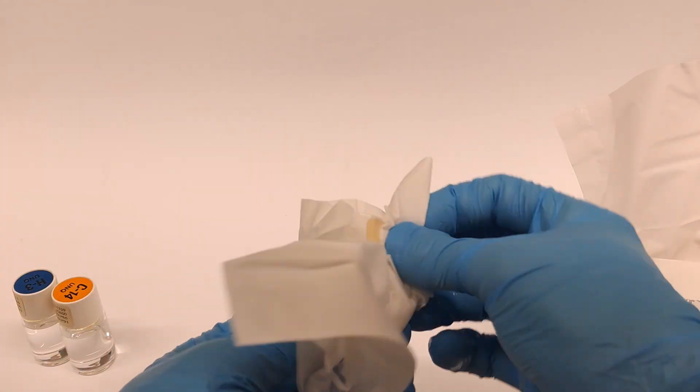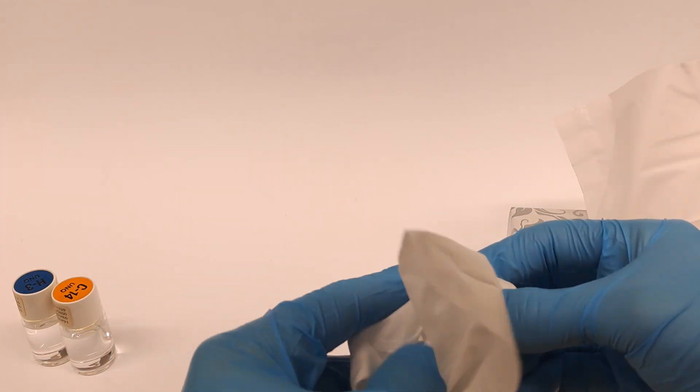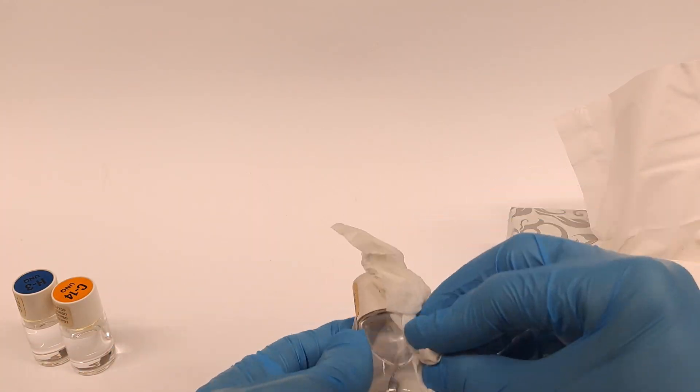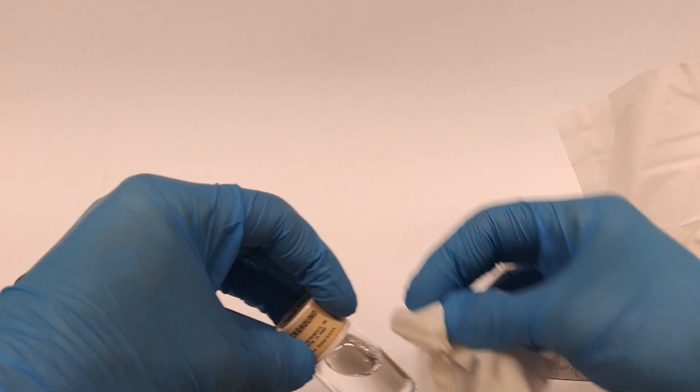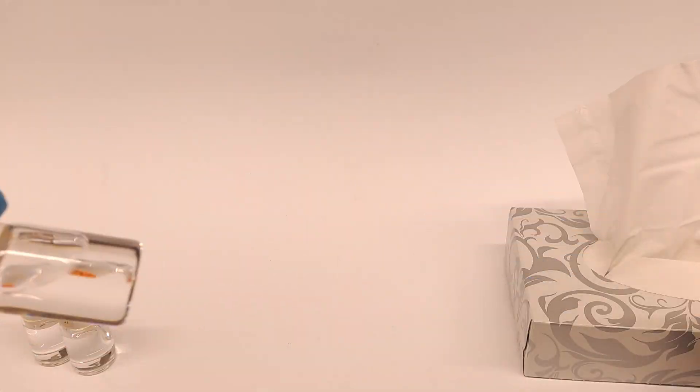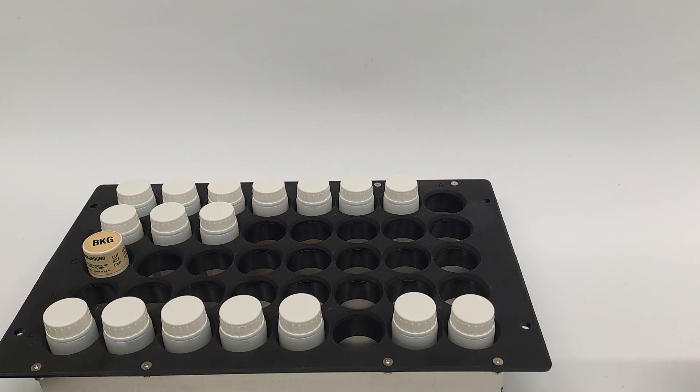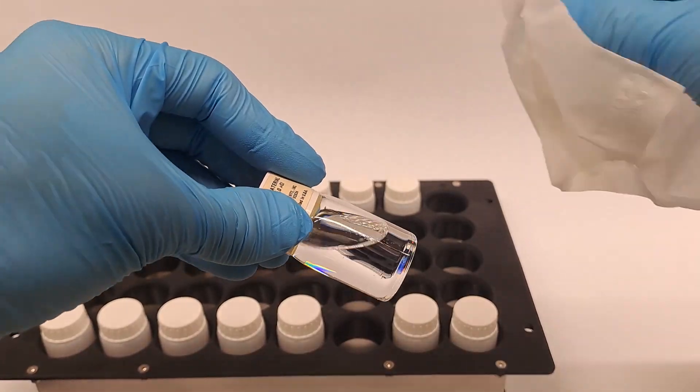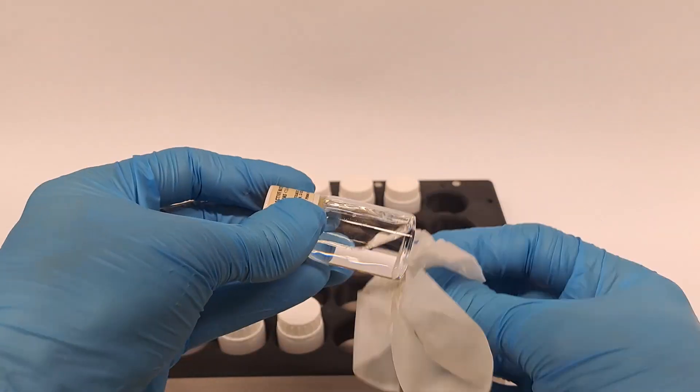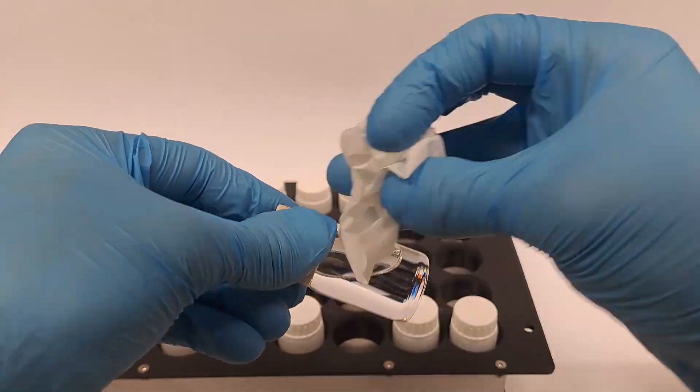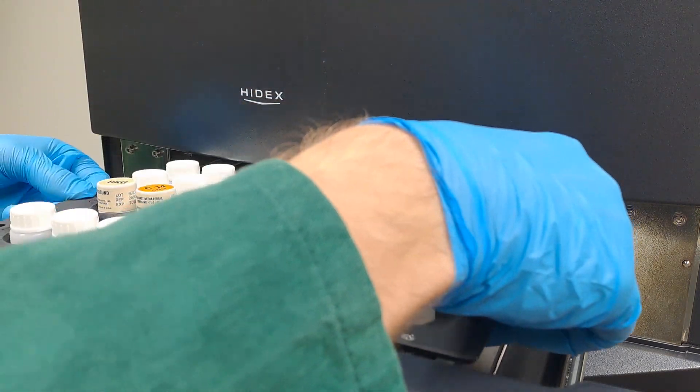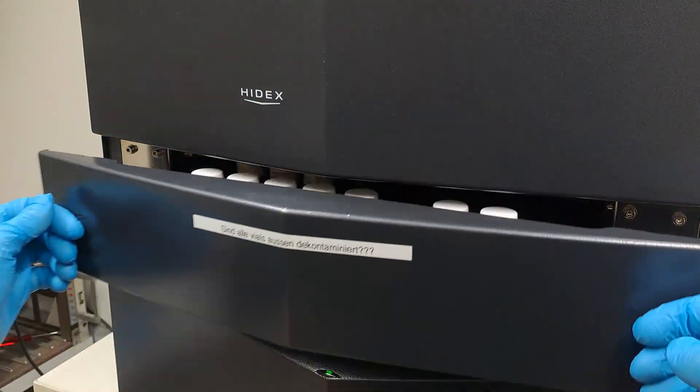Before the standards or any other sample can be placed in the sample tray, it must be ensured that these vials are not contaminated from the outside. Radioactive contamination would be particularly bad because it would make the measurement results completely unusable. Therefore, all the vials are always thoroughly cleaned with ethanol, especially at the top and the bottom where the gripping arm attaches. The clean tray can now be placed into the measurement device with the clean vials.